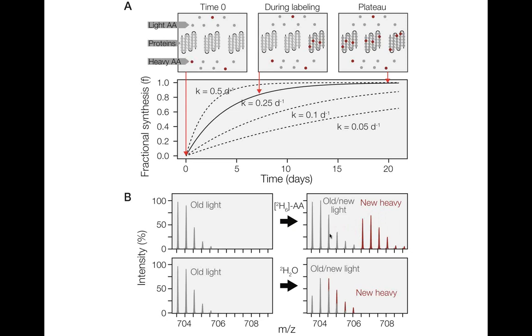In heavy water labeling, because we introduce a rather small amount of heavy water to the peptides, the mass shift is not that drastic, and what happens is the cluster is going to shift in shape gradually, and what ProTurn does is to integrate each of these individual peaks and then to figure out how much exactly new isotopes and new peptides are in the sample.